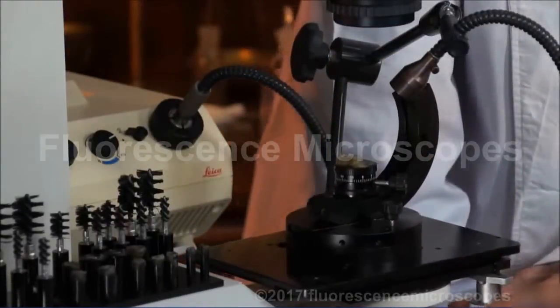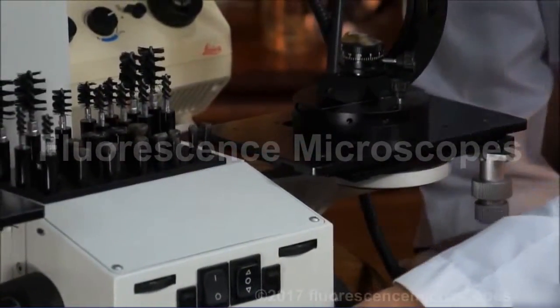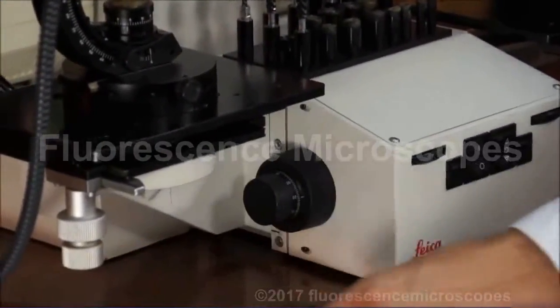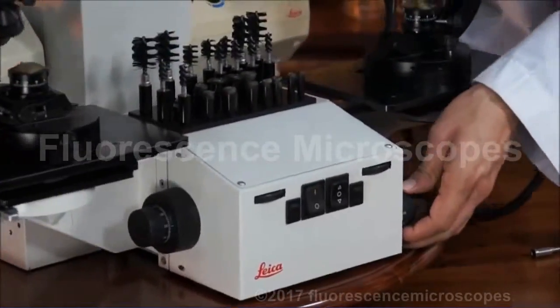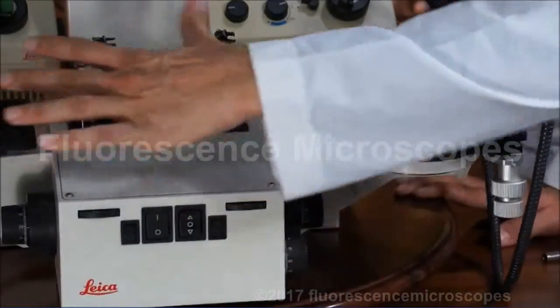In the stages, there's Y movement and X movement — they move independently when you move these knobs. And this knob moves them in the X direction simultaneously, moving this whole part.